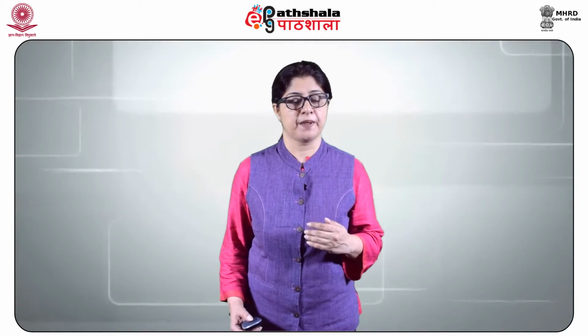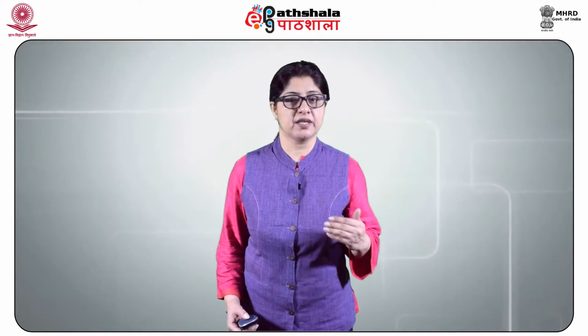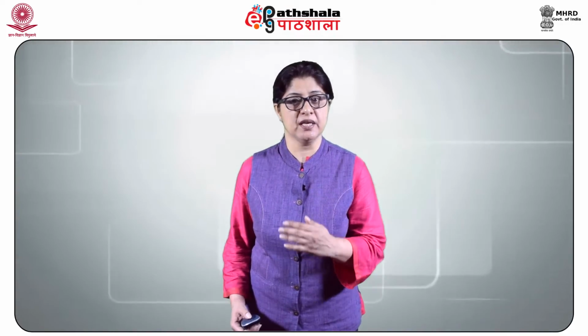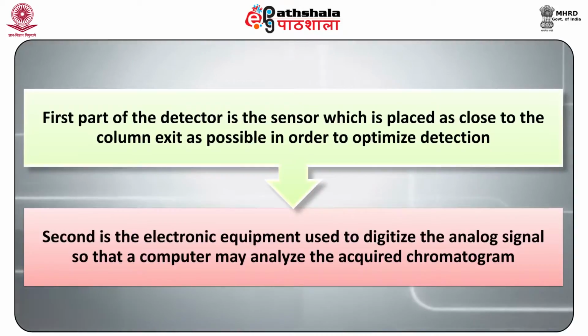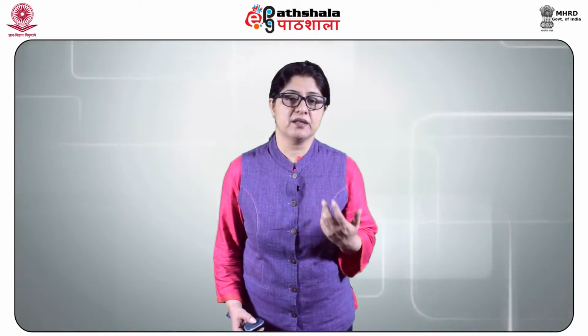Specific properties, such as nitrogen or phosphorus content, have only limited applications, but compensate for this by the increased sensitivity of the detector. Each detector has two main parts, which when used together serve as transducers to convert the detected property changes into the electrical signal that is recorded as a chromatogram. The first part of the detector is the sensor, which is placed as close to the column exit as possible in order to optimize the detection. The second is the electronic equipment used to digitize the analog signals so that the computer may analyze the acquired chromatogram. The sooner the analog signal is converted into a digital signal, the greater the signal to noise ratio becomes, as analog signals are easily susceptible to many types of interferences.